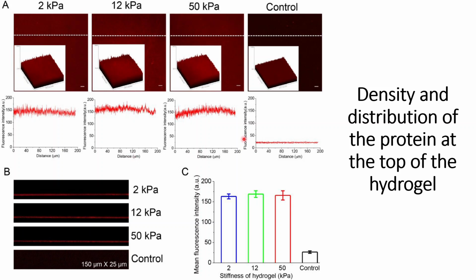In this video we will discuss the density and distribution of the proteins at the top of the hydrogel. Since they are developing a hydrogel, it's essential to know whether the proteins are distributed across the hydrogel or whether they are penetrated inside.